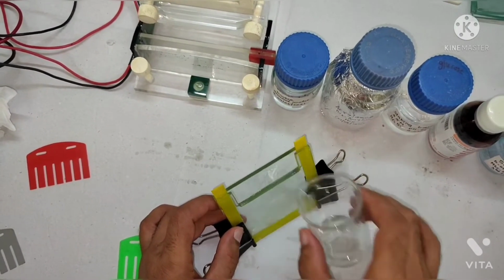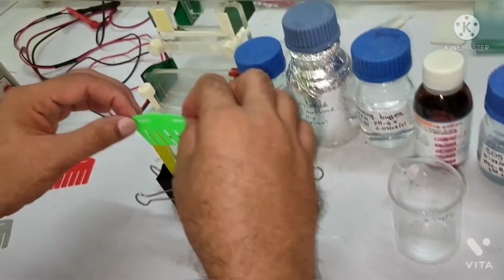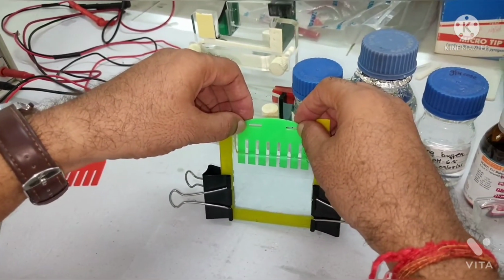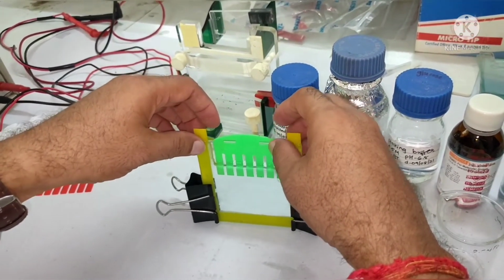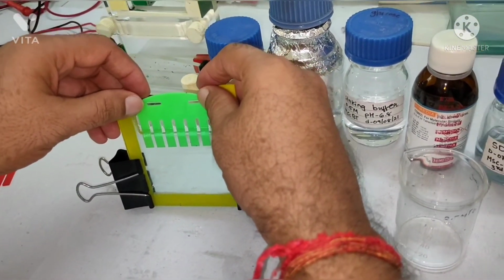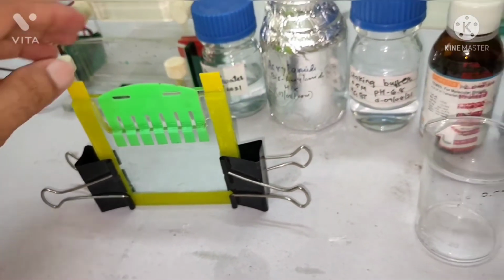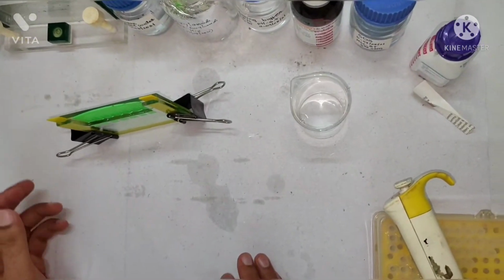See, we filled till the edge, and now our comb is ready. So now we put the comb slowly here. It should be straight, so keep that in mind. Yeah, this is fair enough. Okay, let me take a little more. Now our separating gel as well as the stacking gel both are ready, and now we leave it for 10 minutes.